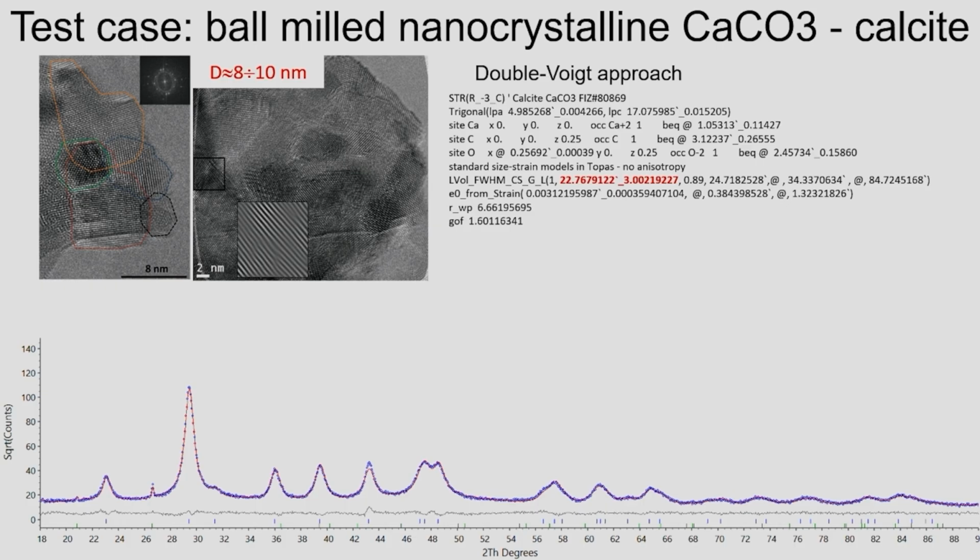But that's it. So in this case, also we see some peaks are too sharp or too broad. Another clue of anisotropy due to what? The shape of the crystal? It might be. Or it might be strain. Again, we use spherical crystals very frequently. And this is an assumption that sometimes is sound, like with the cerium oxide powder I've shown you in the model. You can see in the TEM, spherical, more or less. Many times this is just a sign of ignorance.